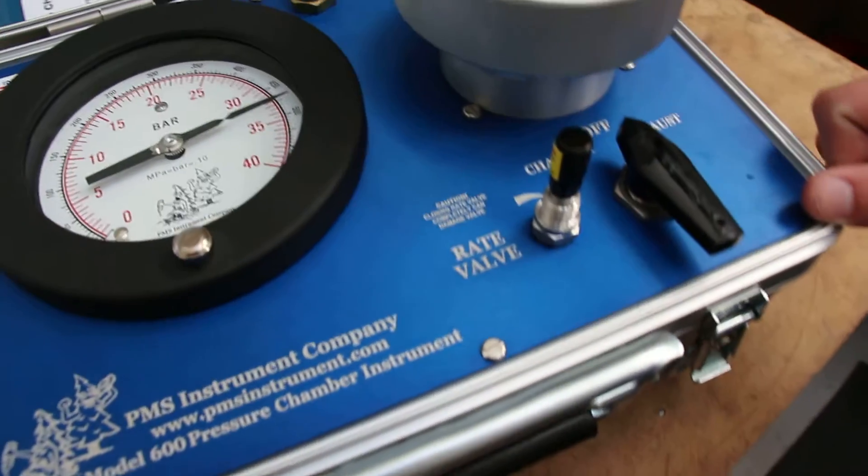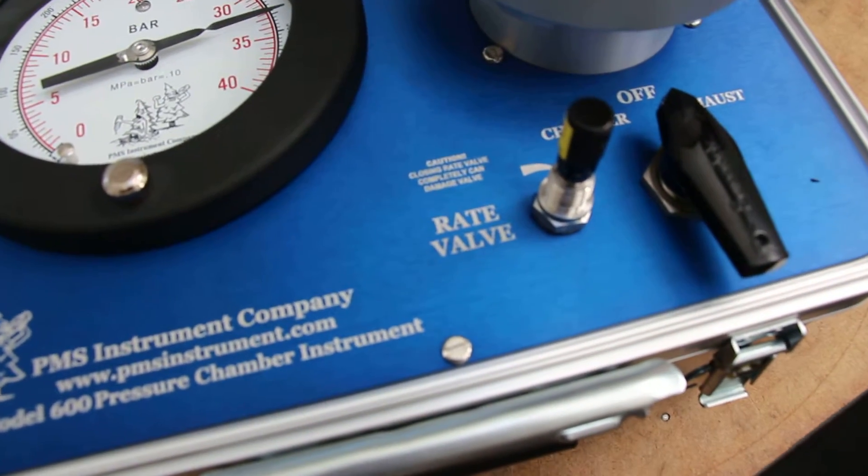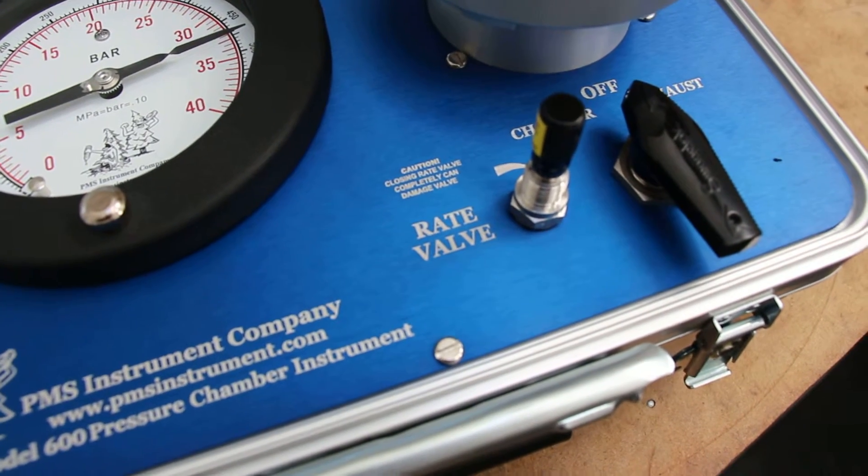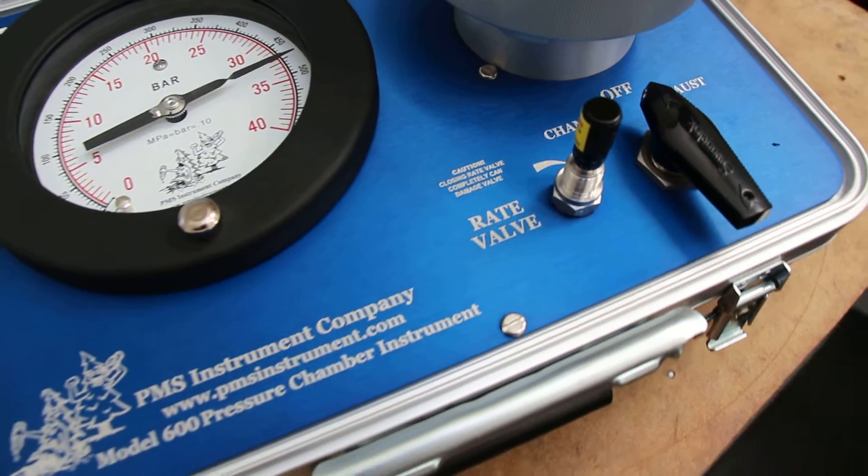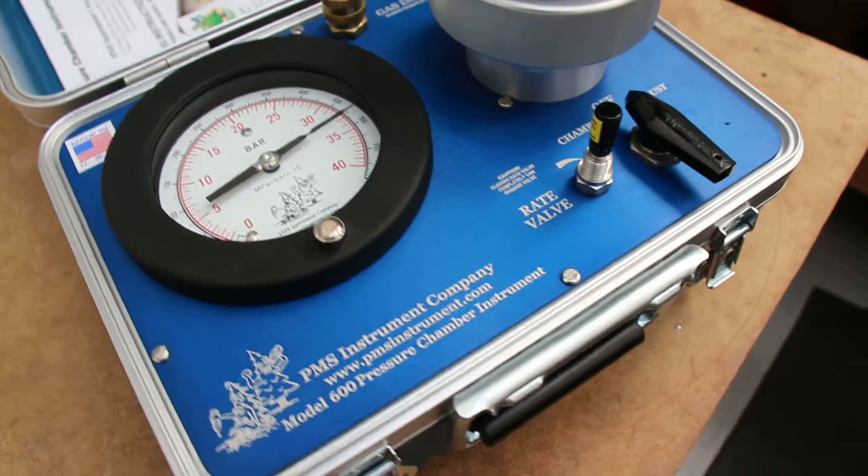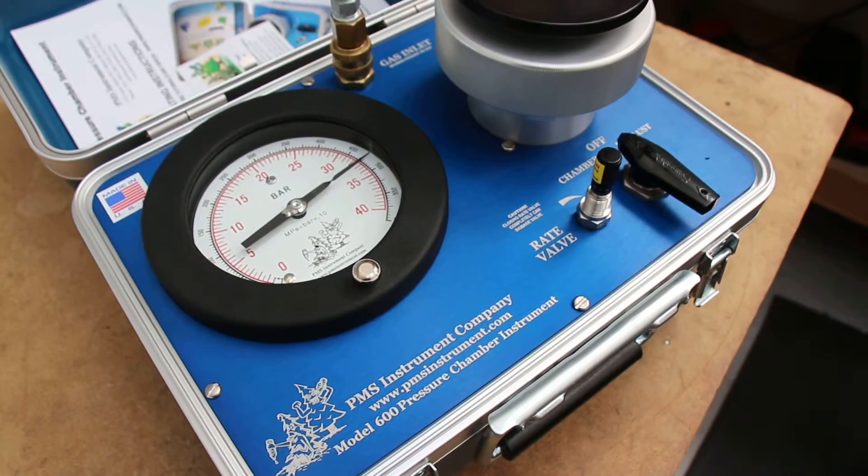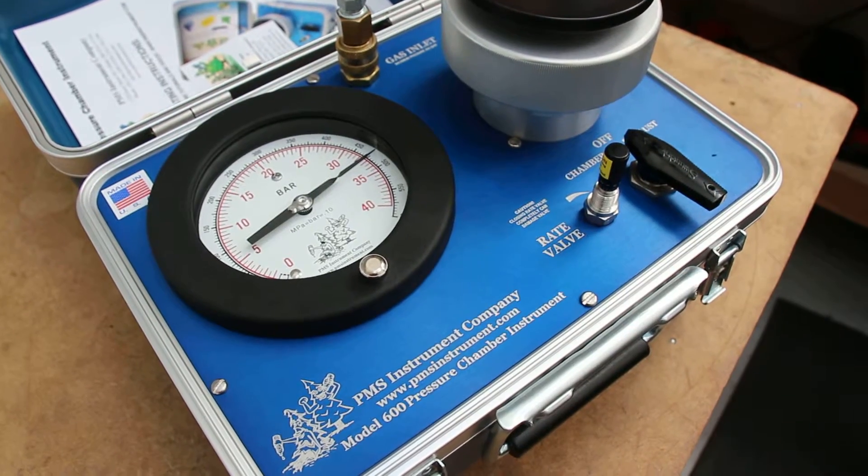Care should be taken when using the rate valve that you do not over-tighten it and run the needle down into the packing, as this could damage the rate valve. For more information about using a pressure chamber or techniques, contact our website at PMS Instrument dot com.